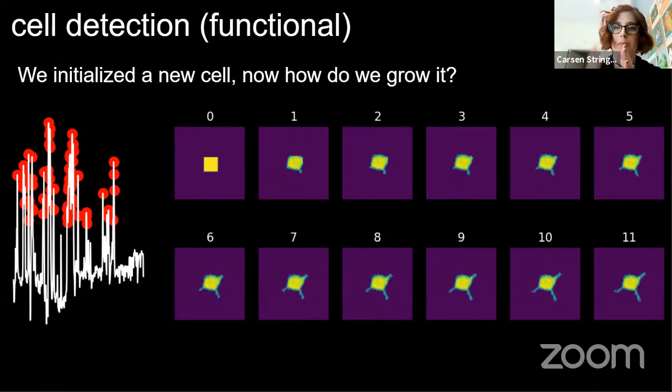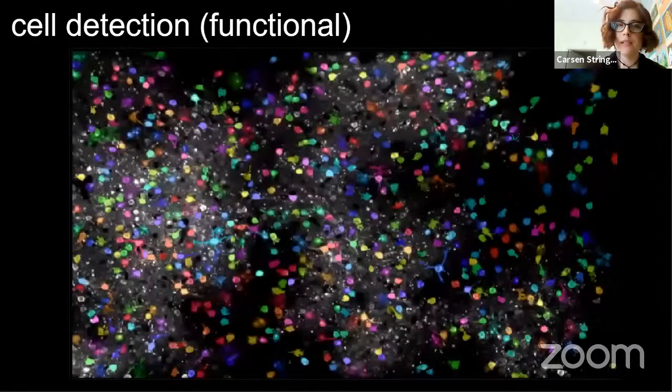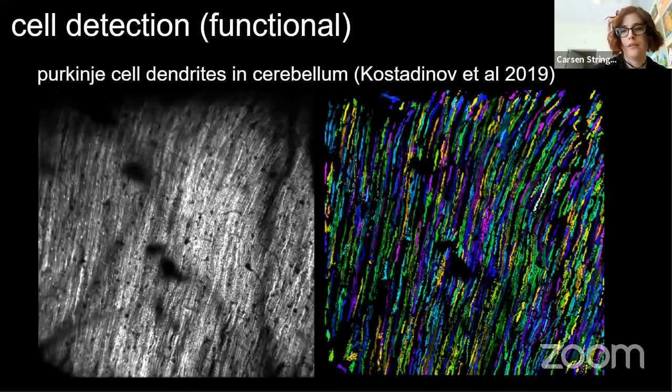And that's what I recommend to people, because then you might have enough information to be able to demix these cells well and have robust segmentation of your cells. Or worst case, you might have to use an anatomical algorithm like Cellpose for your data. Okay.